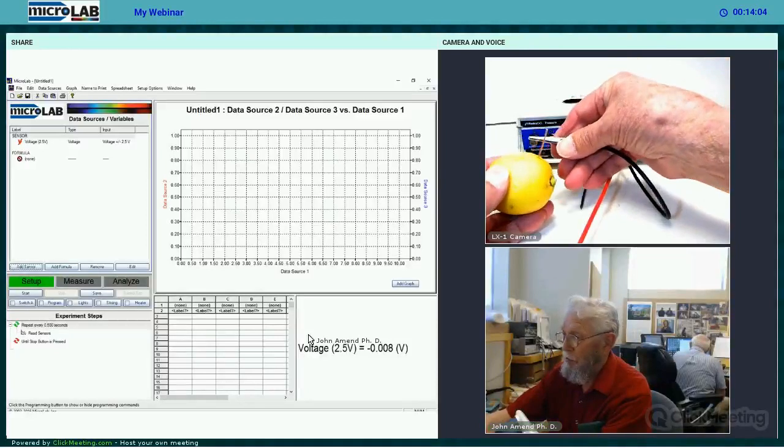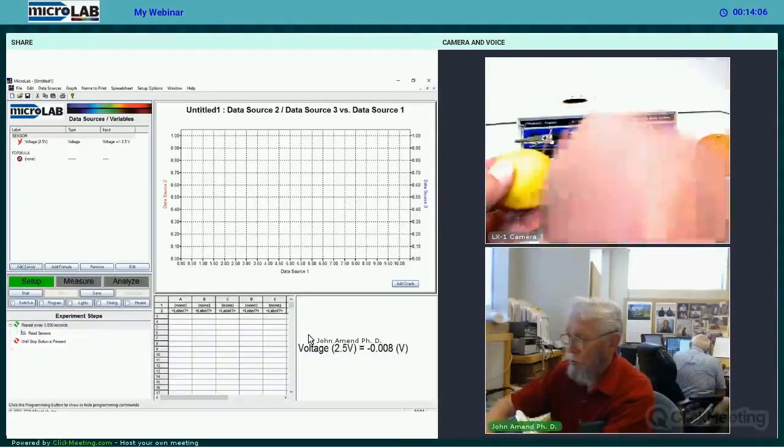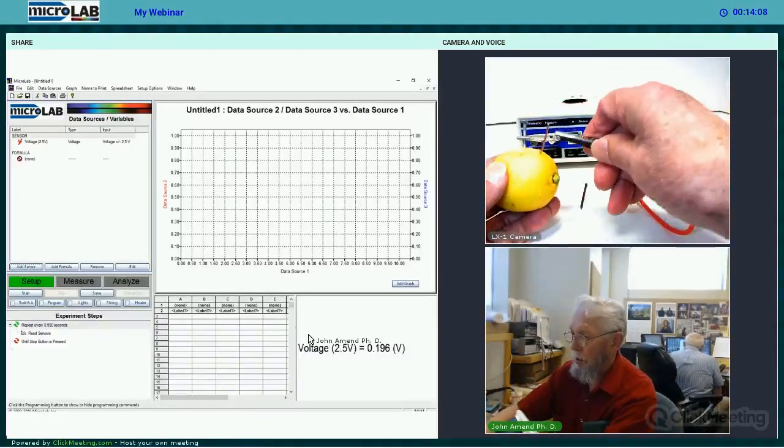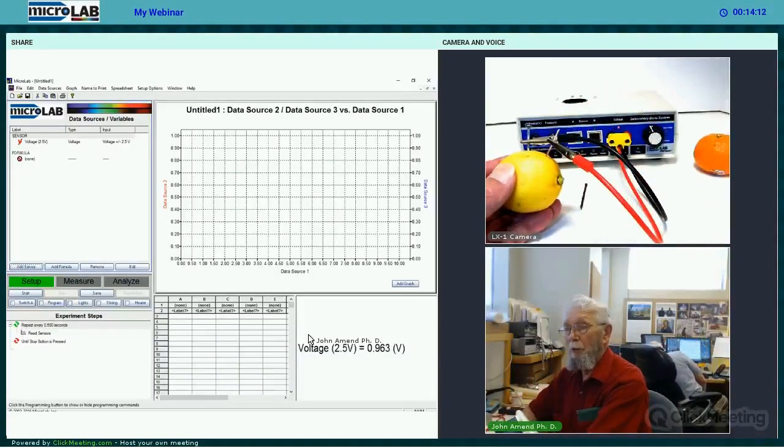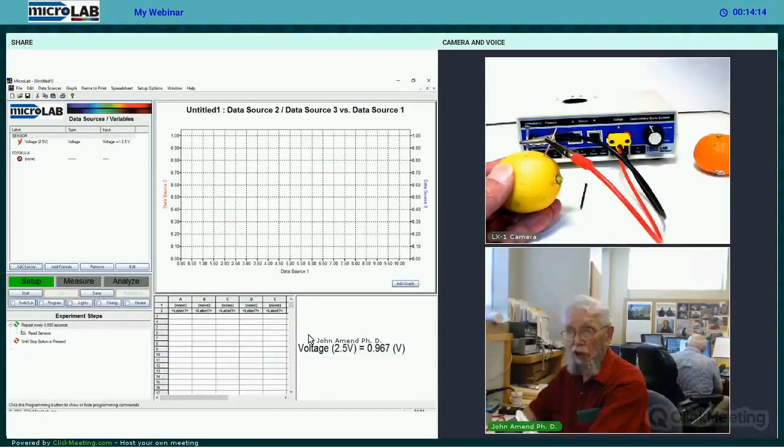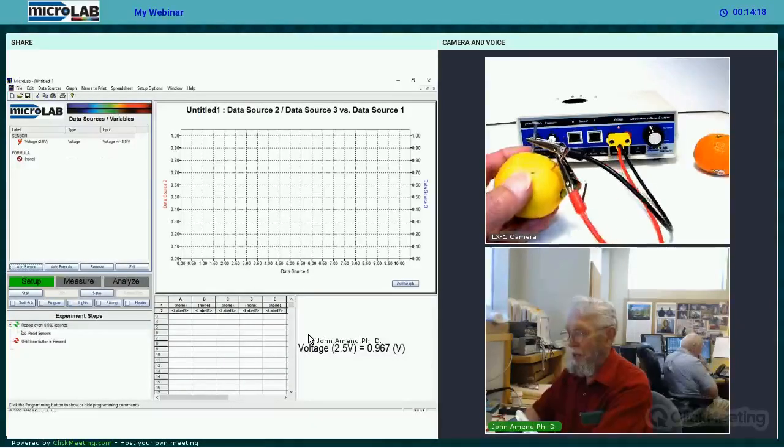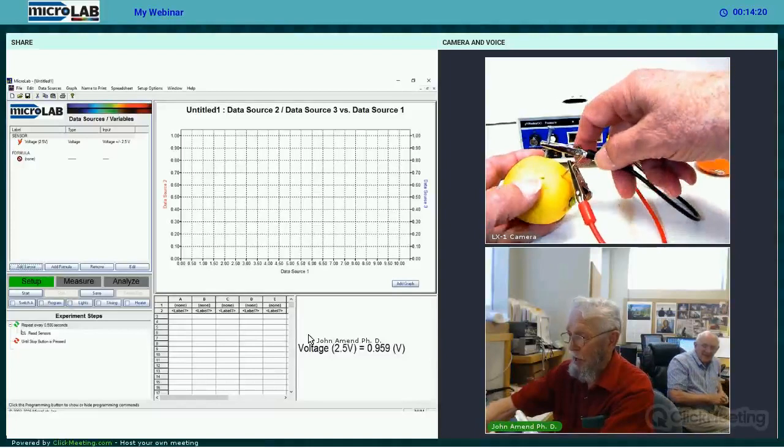And let's do so. So we've got an electrode. Connect this nice pole over here. We'll connect the positive pole over here. And surprisingly, we have something near 1 volt. 0.967 volts. That was amazing, wasn't it? And so we do have it.